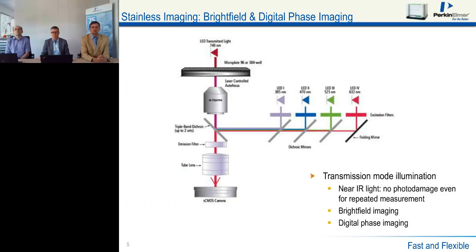My personal favorite, however, is currently bright field imaging. While the fluorescence channels can establish very specific assays, the bright field imaging has the benefit of not relying on fluorescent stains. So even without any fluorescent stain, we can image cells and characterize them.